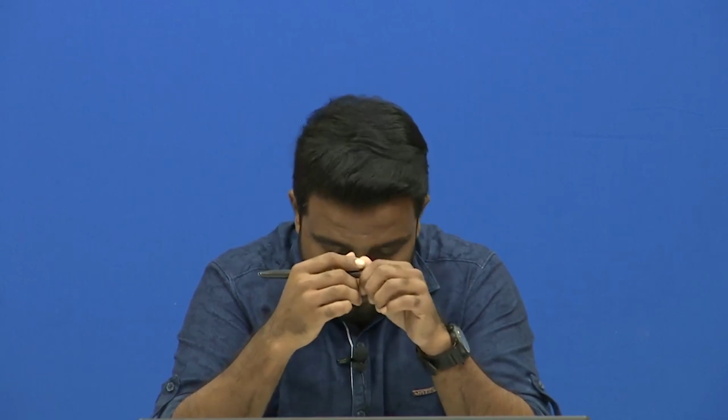Now we are also in between our theory classes, we are using some experimental class, right, and today we will show it to you how to install an oxygen plasma system. Now this oxygen plasma system is a system which uses, as its name says, oxygen. It uses a vacuum and creates a plasma, and this system is used for bonding PDMS with your silicon or PDMS with glass.